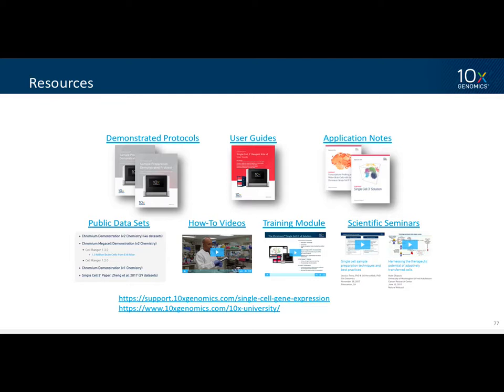But what concentration do they need to be at to load? Would FACS sorting directly into the buffer be too dilute? It depends how many cells you're going to FACS sort. That is a possibility. If you have a very rare cell population, they will be very diluted. At that point, it's a question of whether you can concentrate them, or if they're all you can get, just load them.